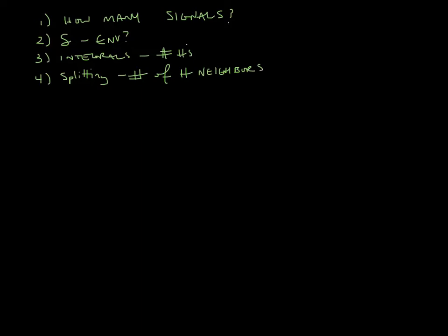Let's do the one that we did on that previous slide, where we got this peak that shows up around 3.4 ppm. And when you use the NMR to integrate that, where it figures out the area under that curve, it comes out to be 2 H's. So pause for a second and see if you can figure out what all of that means.